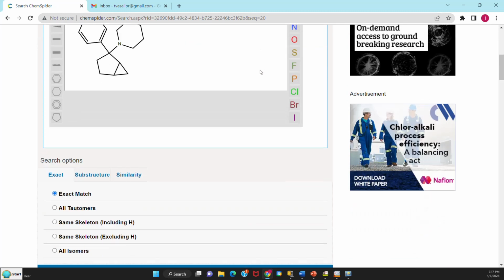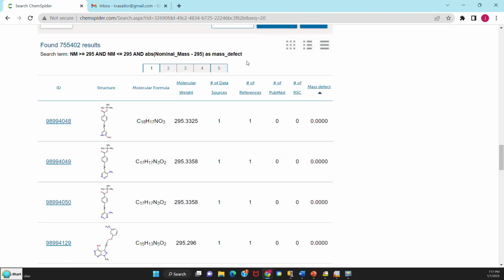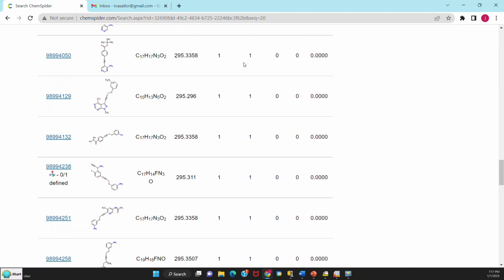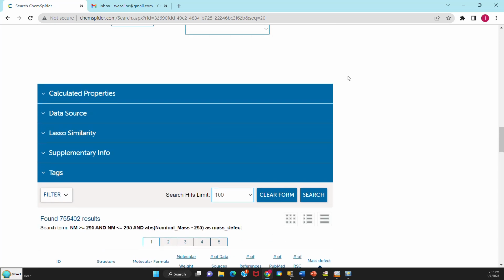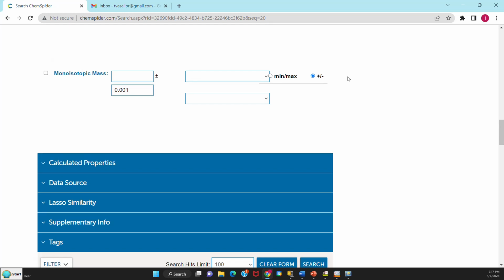It's clean again. You need to make sure the number of hits is right. At the bottom here again, I'm showing the first 100. So be aware of all those parameters, and most of all, be patient. Sometimes the program takes a while to do things, and you think it hasn't done anything, but it's just taken a while.